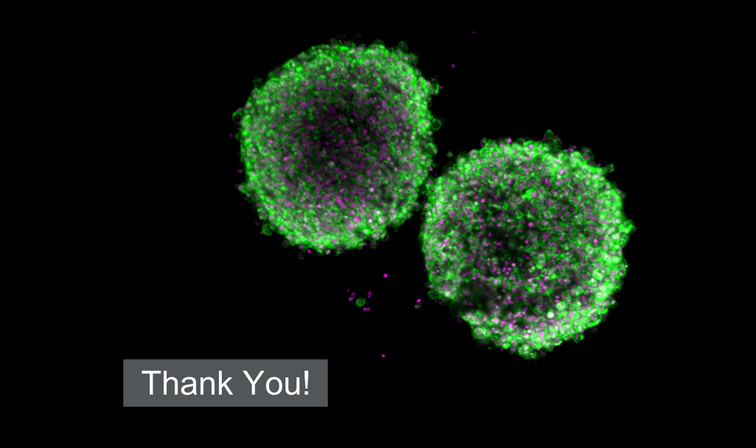And so just take your time, slow down on the pipetting, and gently aspirate your media, and very gently replace with your reagent of interest to make sure your spheroids not only remain in the well, but they remain as a nice intact ball of cells for your research. So thanks for the question.